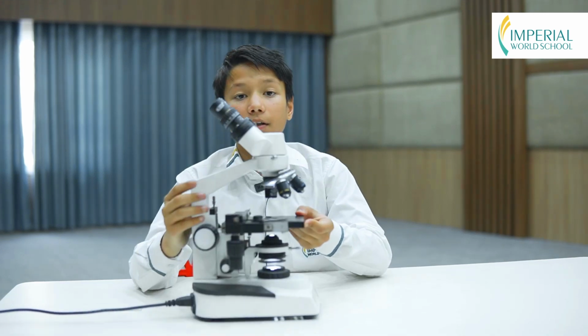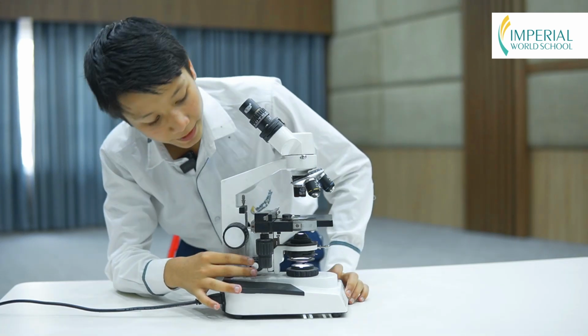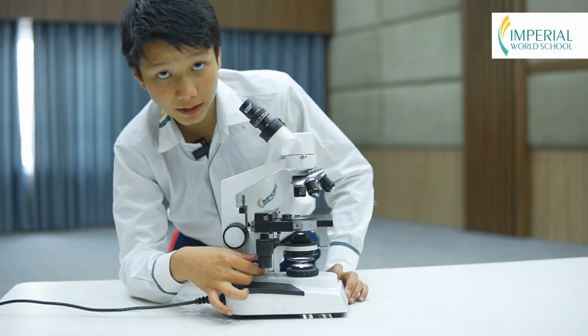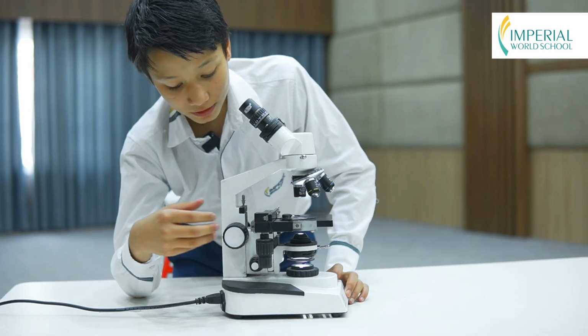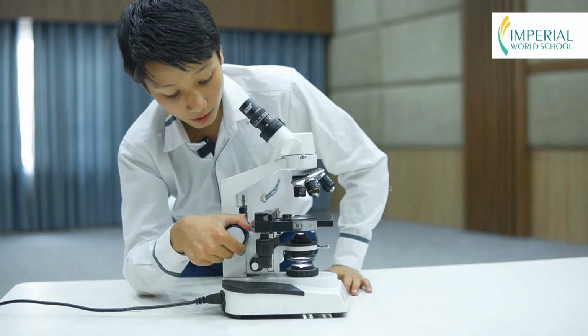As you can see here, this is the ocular lens which helps us to see the stage and the specimens. You can see here, this is the handle which helps us to get a better grip of the microscope. This is the fine adjustment which helps us to adjust the stage of the microscope. This is the coarse adjustment which helps us to adjust the microscope up and down.